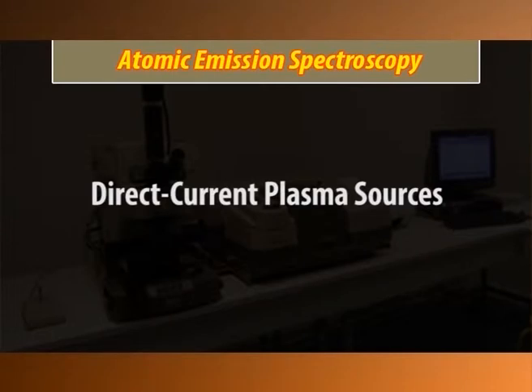Direct current plasma sources. In direct current plasma sources, that is DCP sources, a high velocity inert gas produces a high temperature plasma and separates the excitation region from the analytical observation zone. In a typical DC arc discharge, the current density and the energy available for atomic excitation are independent of the arc current.